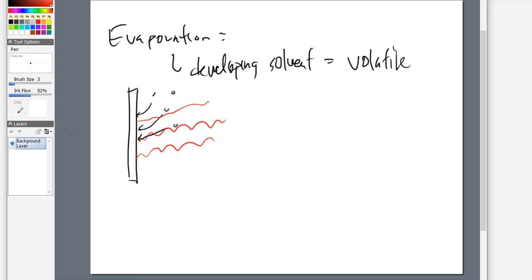In addition to that, as my plate begins to suck up the proper mobile phase, it's going to suck up and up and up. And then down here, where it's really wet, really saturated, if there are volatile components, then guess what? It's evaporating from the actual mobile phase as well as it begins to travel up. So evaporation is everywhere. It is taking part in 3 different areas.